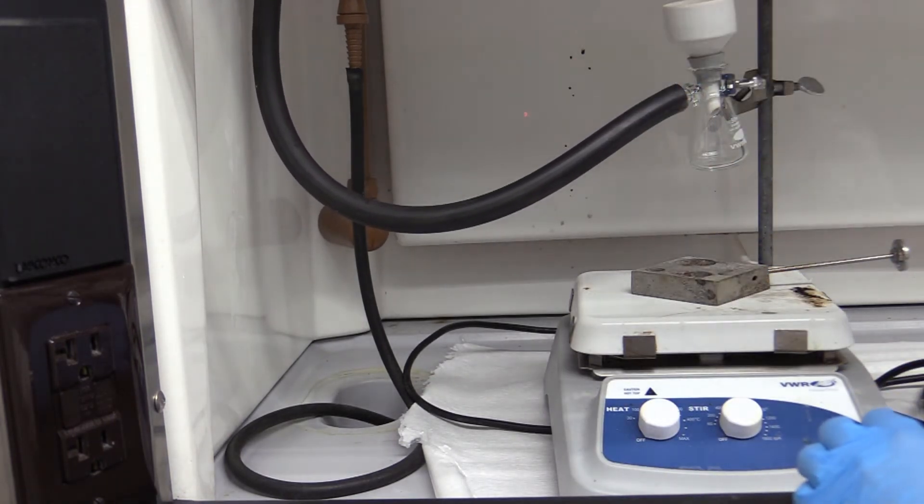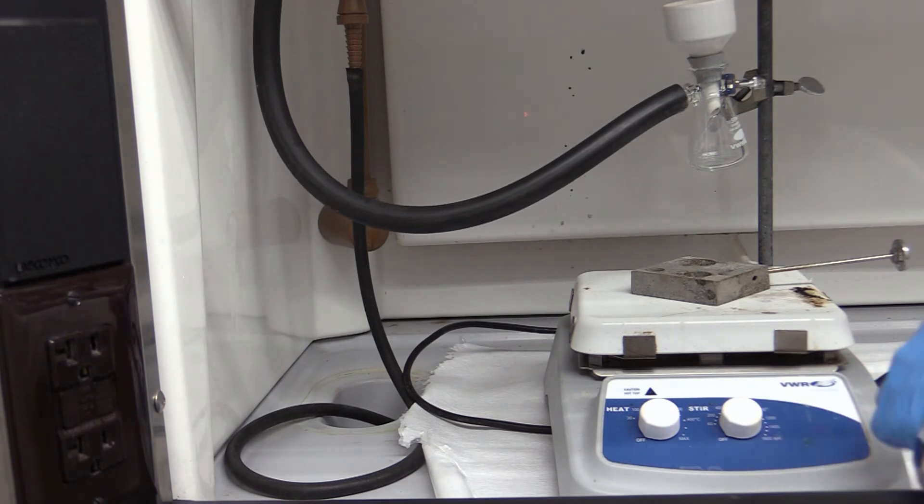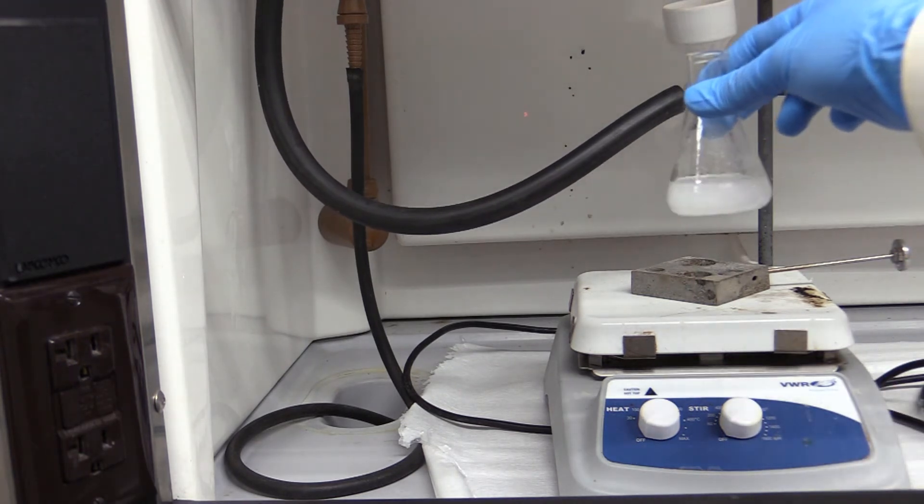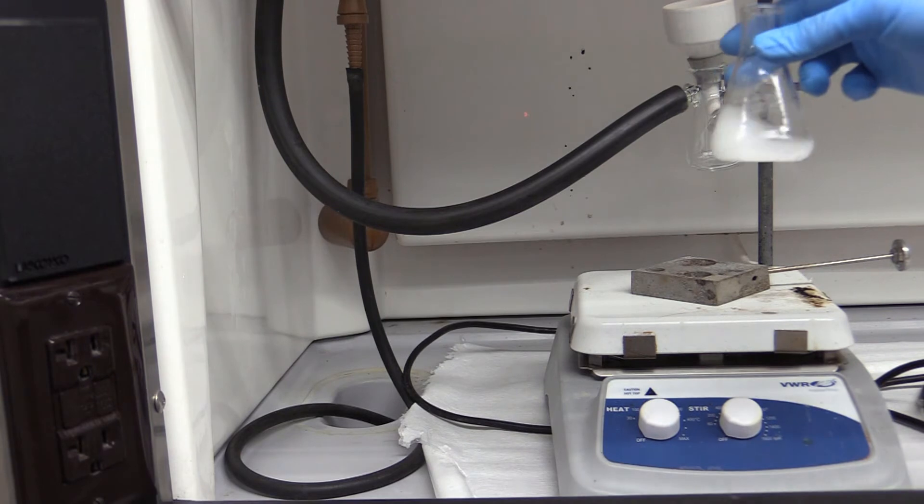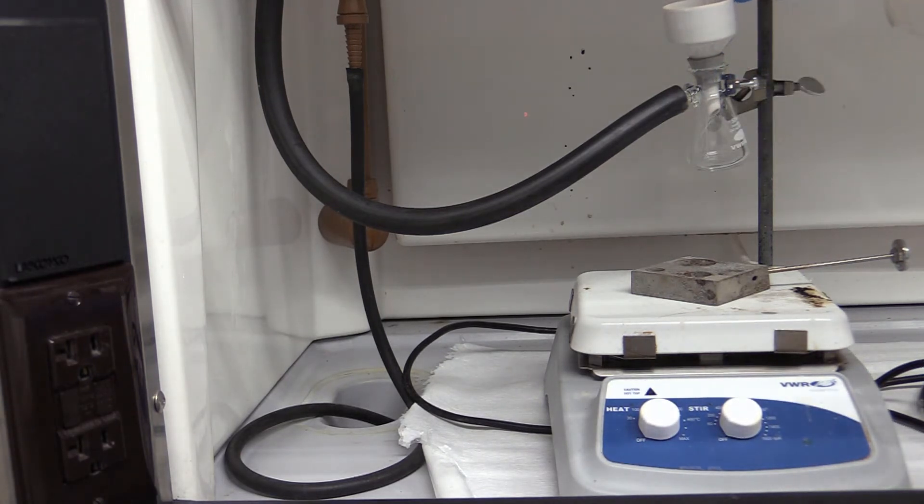You will need filter paper. Wet the filter paper with your solvent once you put it in the funnel to create a seal. Turn the vacuum on and swirl the flask and pour it into the filter. Use a little bit of the cold solvent to transfer the rest of the crystals into the filter.